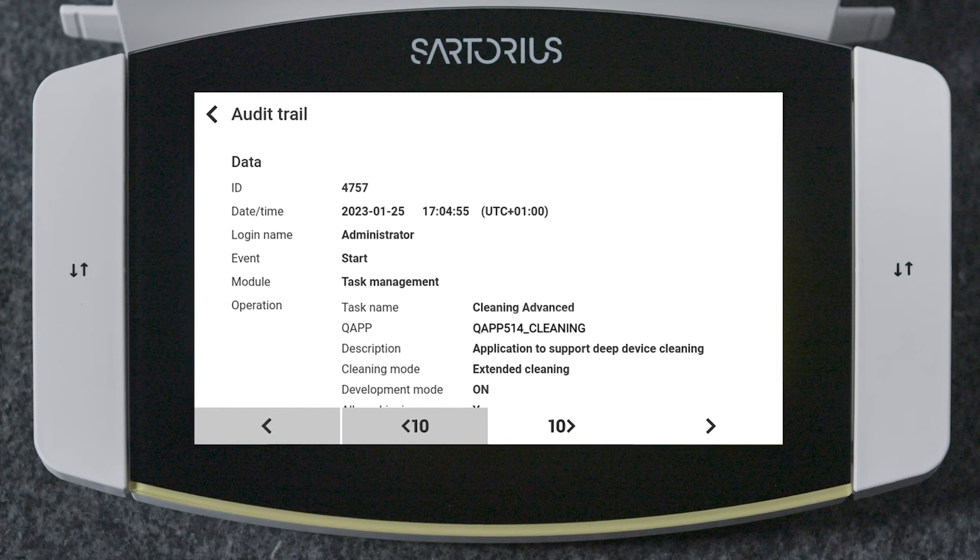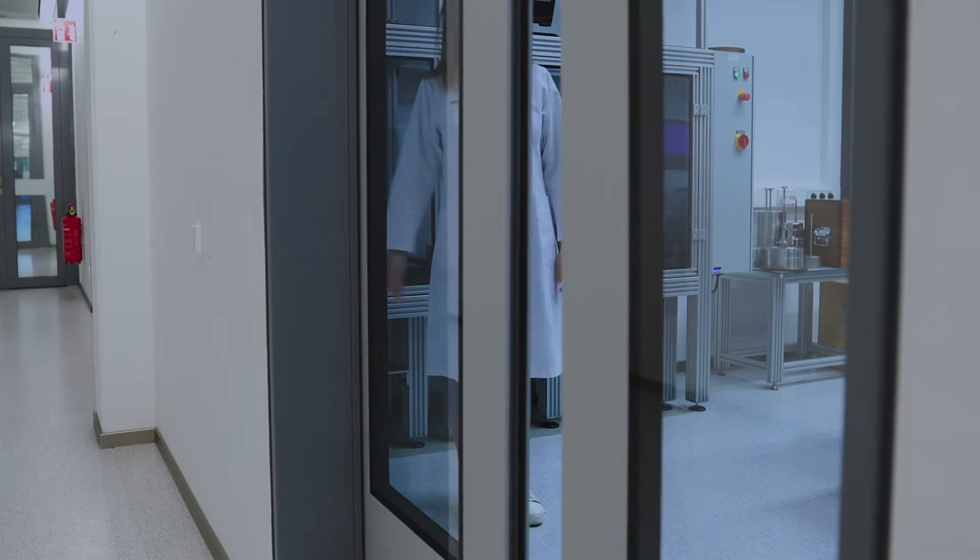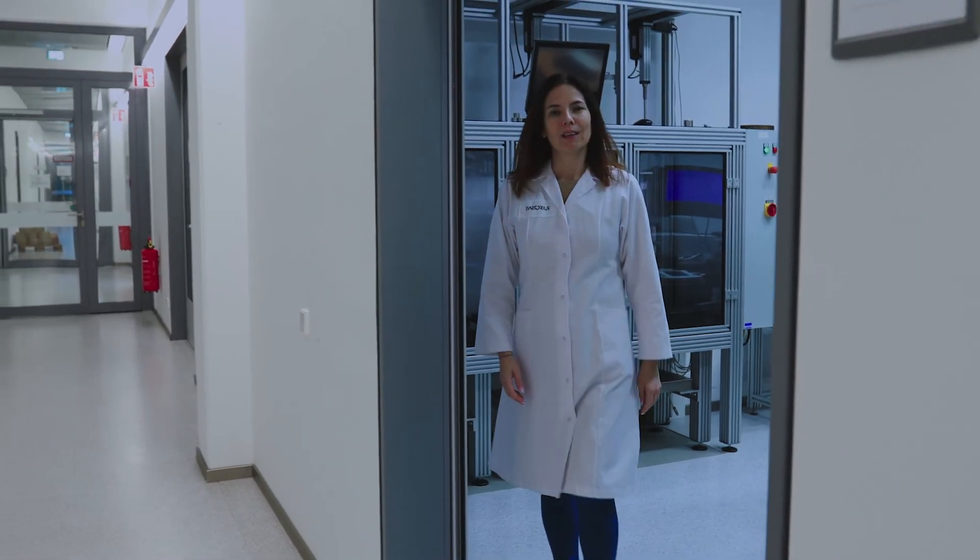If you need to keep records of your cleaning process for your compliance needs, the new cleaning app helps you do that. The app maintains a complete record of all cleaning events in the audit trail. The new QBIS II Ultra High Resolution Balance was made with our customers in mind. We know cleaning can be a challenge — that's why we made the process simple and straightforward, so you can focus on what's important.